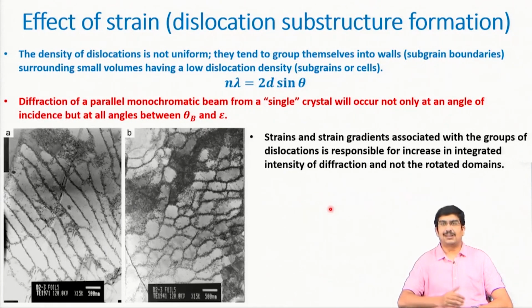And after the discovery of transmission electron microscopy, when people were able to see the materials and their internal structure in great detail, they understood that these mosaic structures resemble the dislocation structure very well. If a material is heavily deformed and contains a huge dislocation density, then those dislocations form their own structure within the material, and those structures, size-wise and misorientation-wise, very much resembled these mosaic structures.